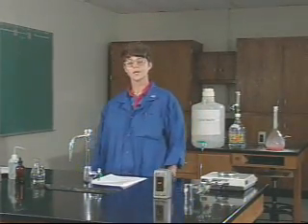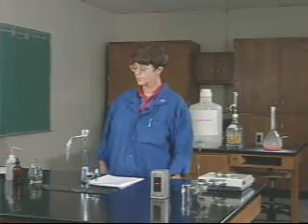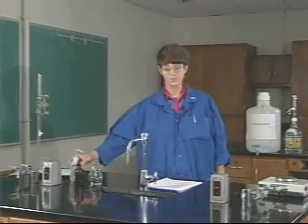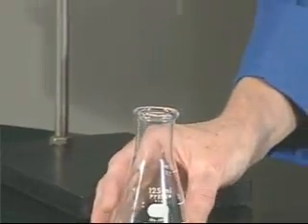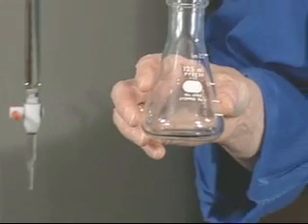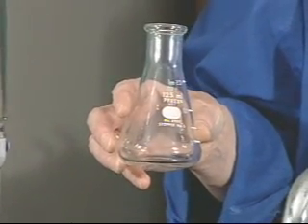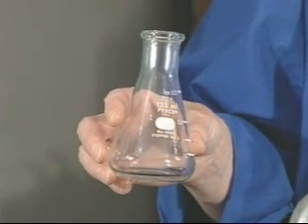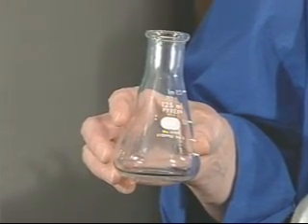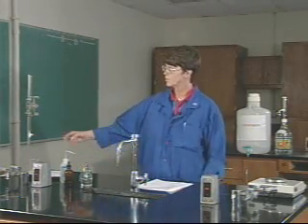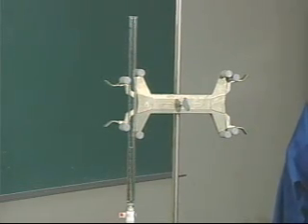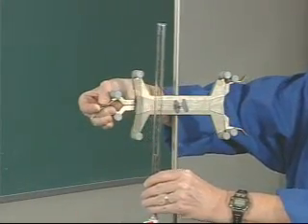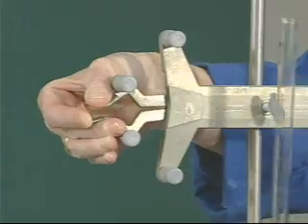The equipment that you'll use today, for the most part, is already familiar to you. You'll need a beaker, a squirt bottle with distilled water, and a flask you haven't used before called an Erlenmeyer flask. As we proceed with the titration, you'll see why we've chosen to use this instead of a beaker — it's much easier to prevent splashing. You also will need a ring stand, and two items that are new to you: a burette and the clamp for the burette.